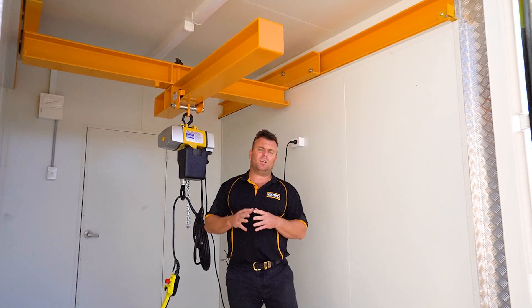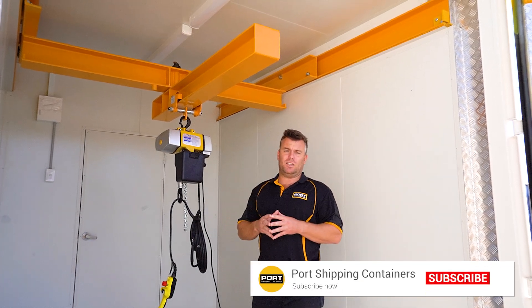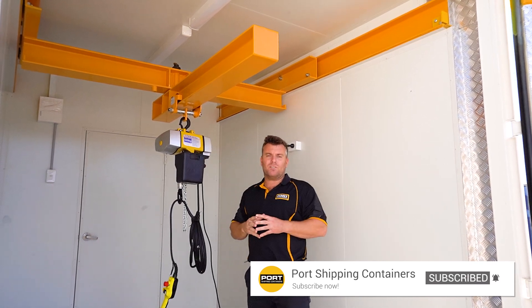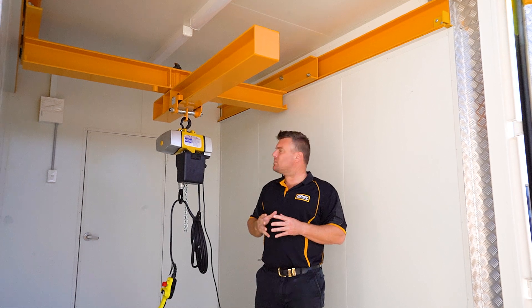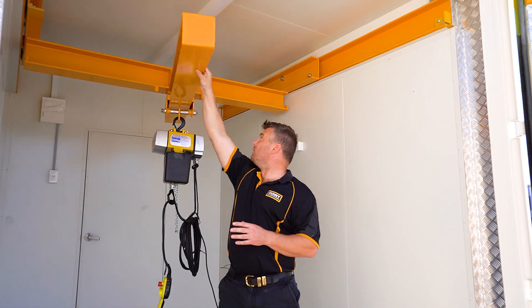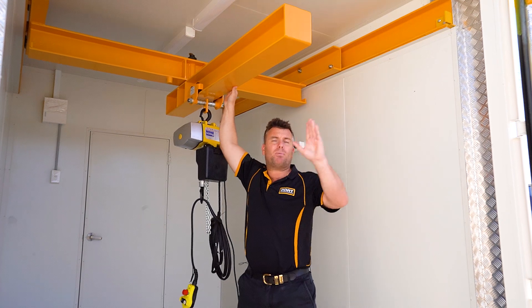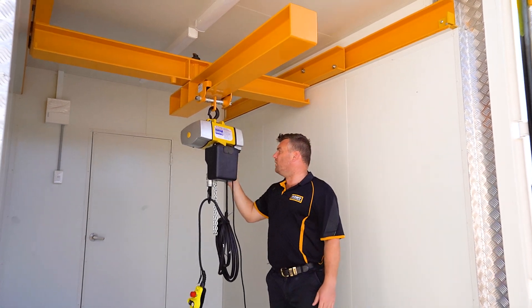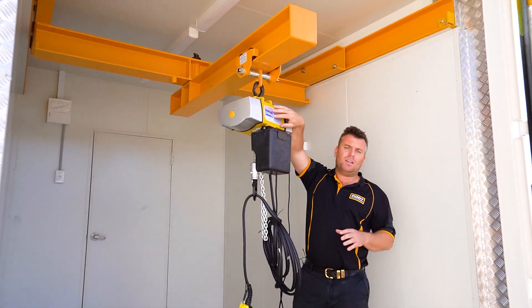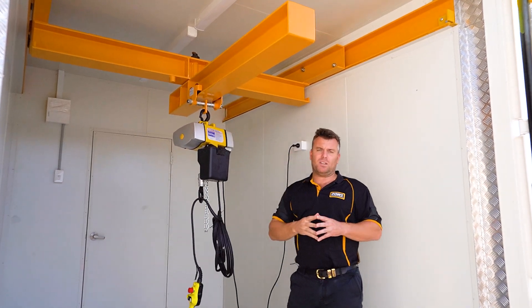Just a little bit more detail on this particular overhead crane — we've rated it for a 500 kilo lift, and that's rated at the winch level. Obviously the crane is rated to far greater than that. The jib arm does pivot, and then we've got the racking overhead that brings this right out past the container doors, as well as the winch itself being on rollers. So there's not much space that we can't grab with this winch and bring it into the analyzer station.